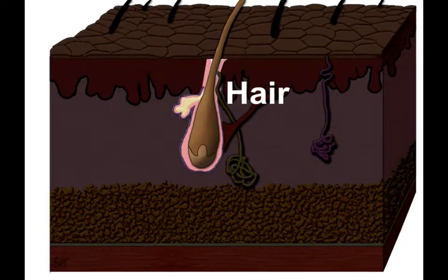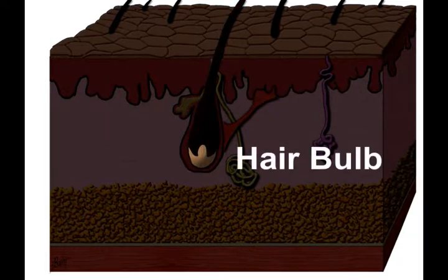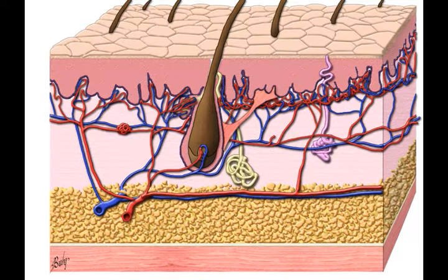The hair unit itself will be discussed next. The follicle is noted centrally, surrounded by a follicular sheath. The hair bulb is the lowest portion, where the germinative epithelium resides. We'll look at the structure of the hair. We'll discuss the individual components of the hair follicle next.